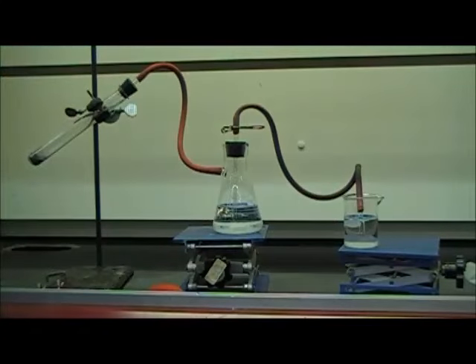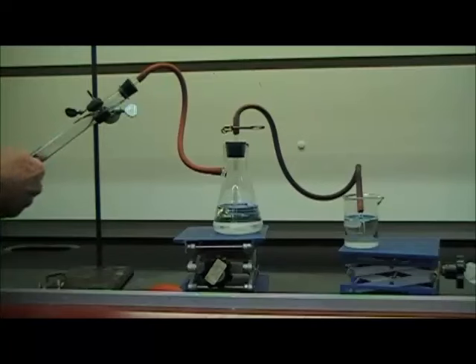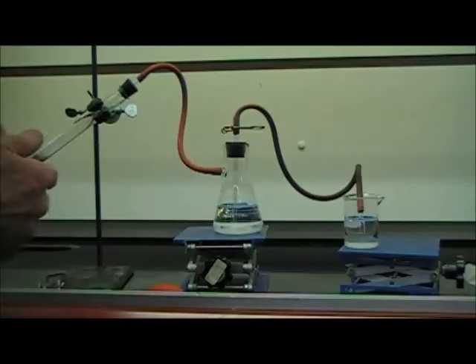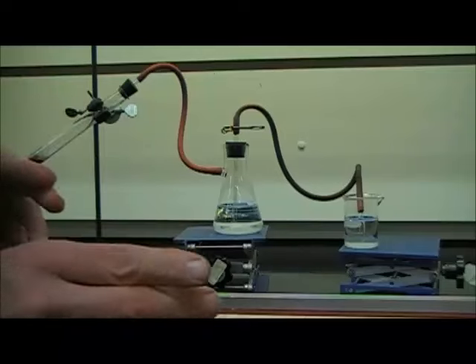Okay, is the tube cool enough now? It's still a little warm. We're going to let it sit a few more minutes. Okay, so now we carefully touch the test tube and we see that it is absolutely stone cold, same temperature as the surrounding air. So we have to do that leveling thing again one more time.